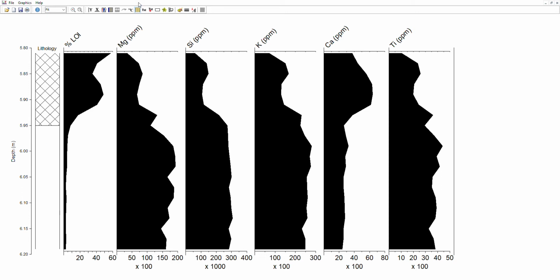Let's complete that. So the next one is at, let's say, 5.952. What's the bottom of that? 6.2. There's no lower boundary. It's clay. Clay is Argilla steatoides. These are the little L signs. Click on the L there. The green tick again, just to post that down here. And if we OK that, that should appear down there.